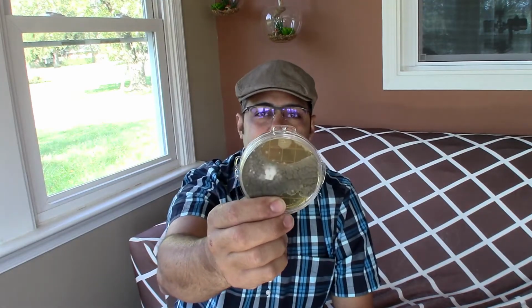Now this is not a diffusion plate or a diffusion test to check for antimicrobial agents, but still we can see it in there, which is very interesting. This is probably what happened to Fleming when he saw that Penicillium growing in those plates, killing all those bacteria. This resembles what he saw at some point in his experiment.